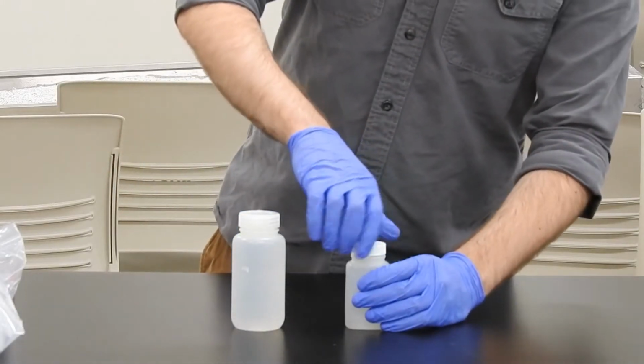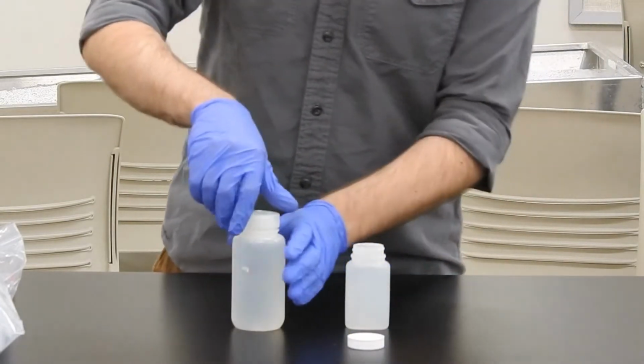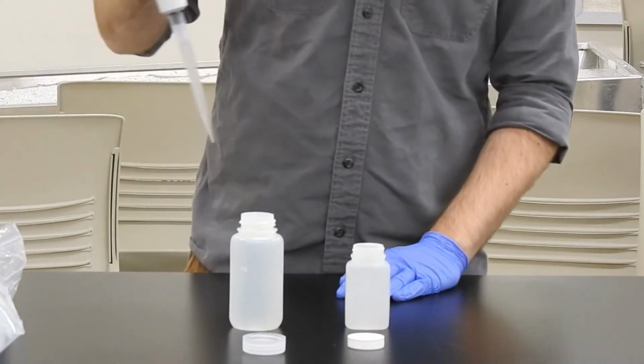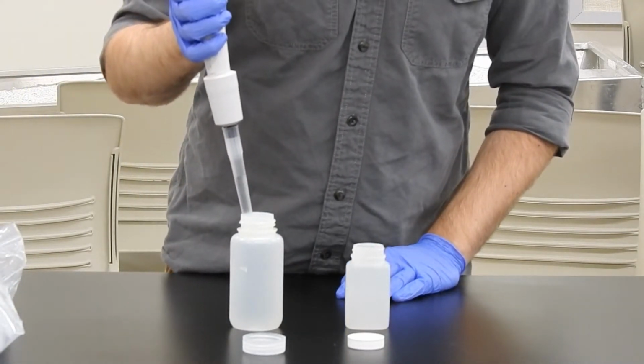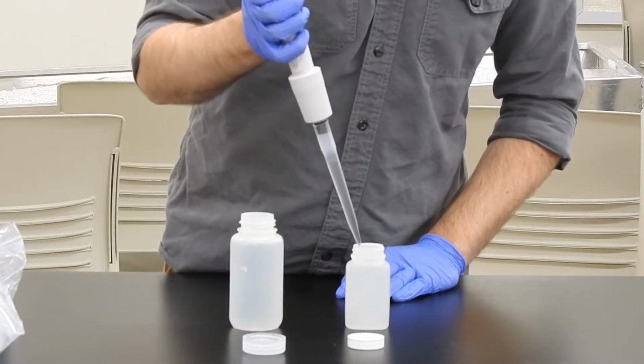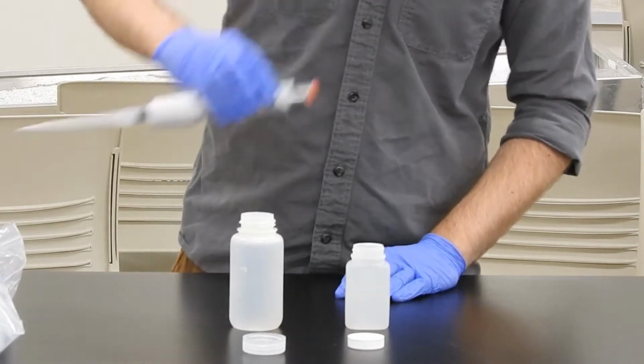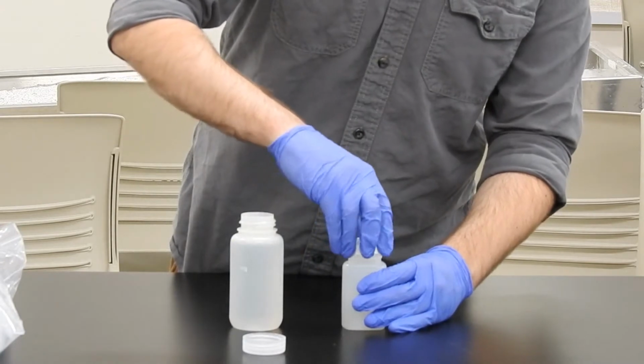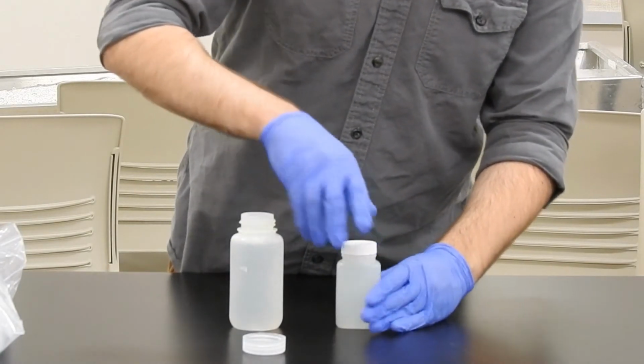The first step for bacteria is to pipette 10 milliliters of the river water sample collected by the volunteers into 90 milliliters of the pre-prepared ultra-pure water. This is simply to dilute the sample for the processes that we'll do later so that we can properly quantify the amount of bacteria present within the river water sample itself.